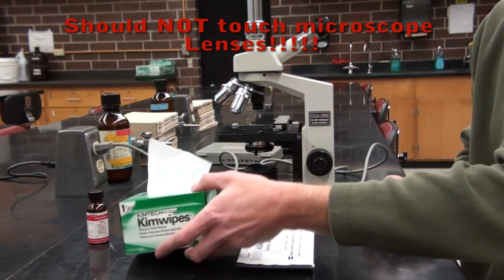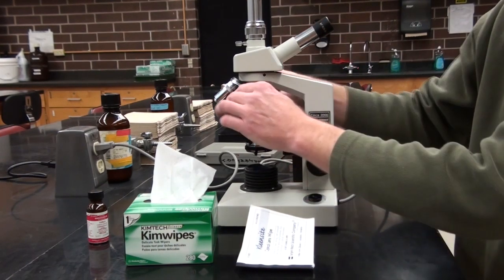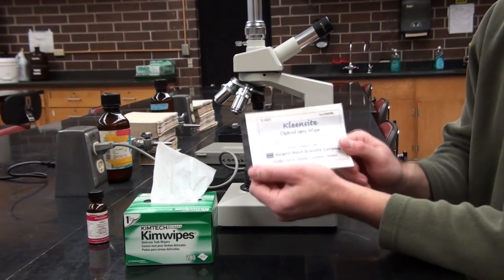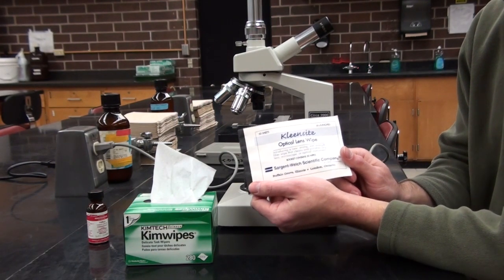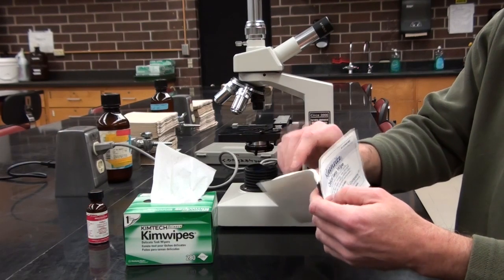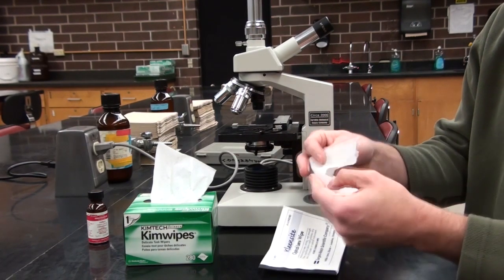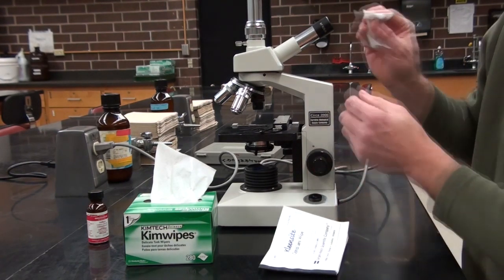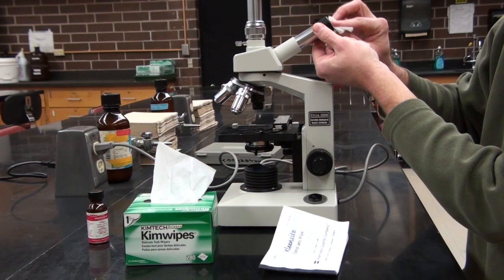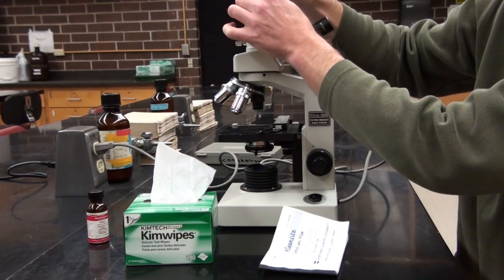If you have anything wrong with the actual microscope, like maybe the eyepiece is dirty, or the objective is dirty, or maybe the condenser, what you'll want to use is what we call an optical lens wipe. To use this, we'll rip out a piece of paper, ball it up a little bit, and in a circular motion gently wipe it. This can get off any oils and different types of things that may be there.